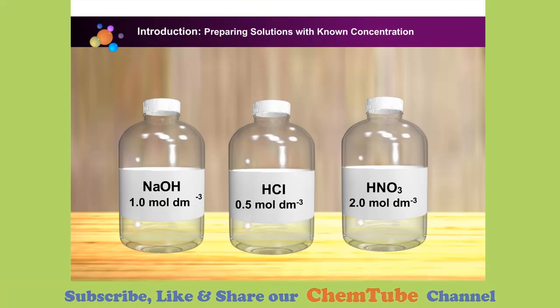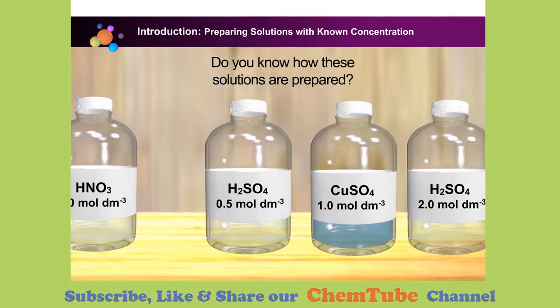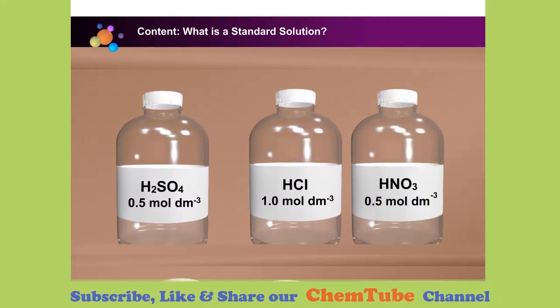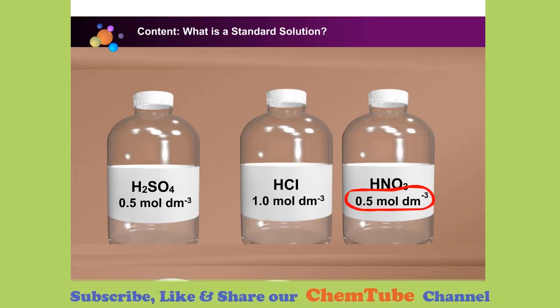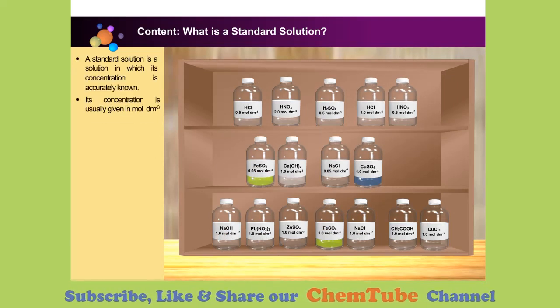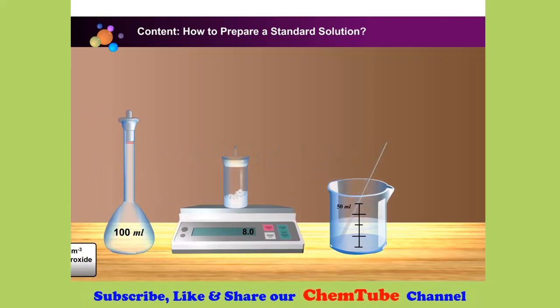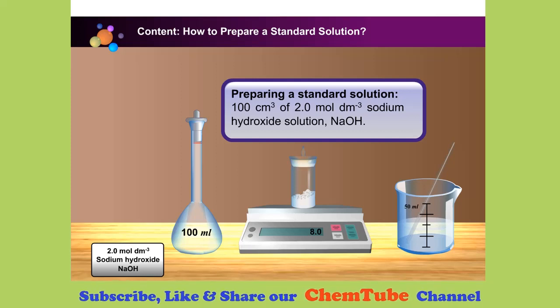Most of the solutions in the laboratory are labelled with known concentrations. Do you know how they are prepared? Different bottles have different labels of concentration, and from the labels, we know that the solutions have their own exact and specific concentrations. A standard solution is a solution in which its concentration is accurately known, usually given in mole per cubic decimetre. Now let us prepare a 100 cubic centimetre of 2.0 mole per cubic decimetre sodium hydroxide solution.